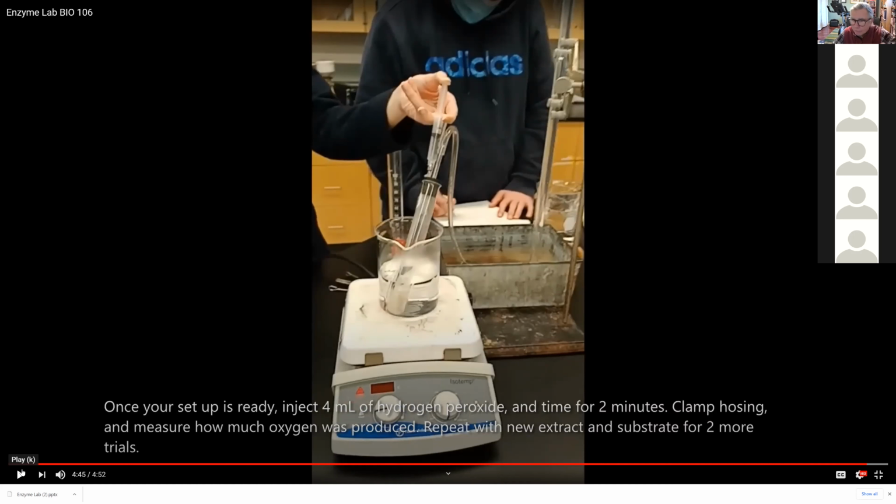Once the hydrogen peroxide is injected, they twirl it once, they leave it in the same temperature, and it's only a 2-minute experiment. Do all this for 2 minutes. And after 2 minutes, you go over to the eudiometer and you measure how far the water has dropped, and you get a new reading below.